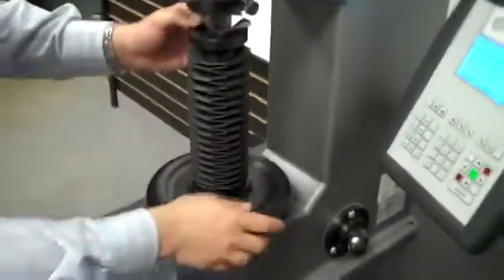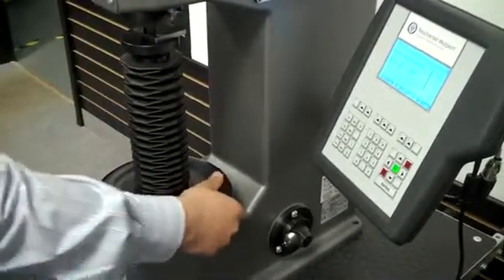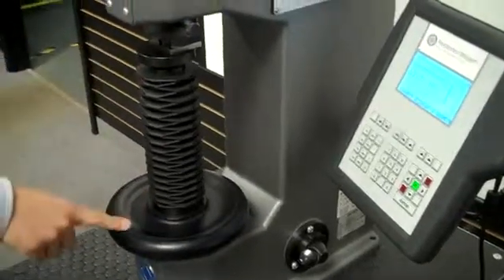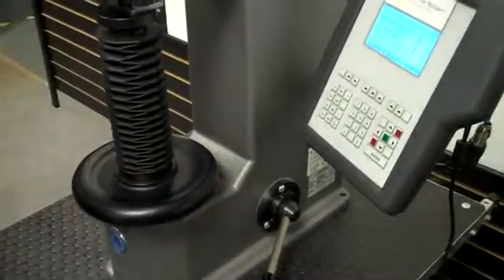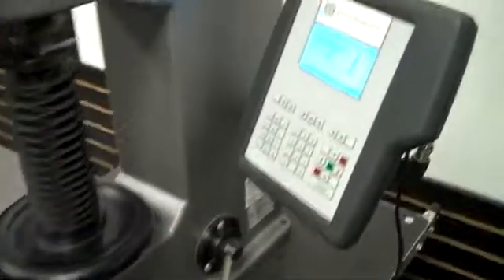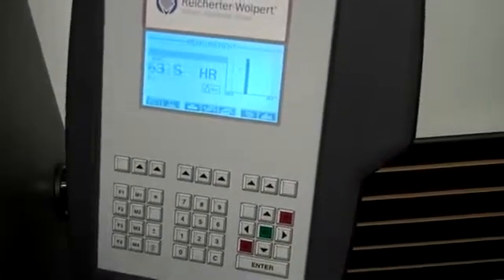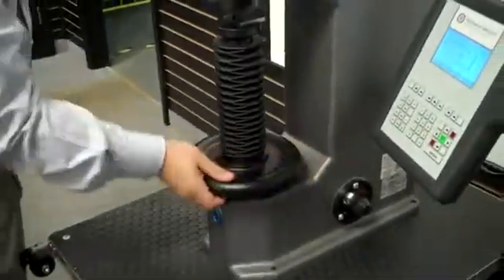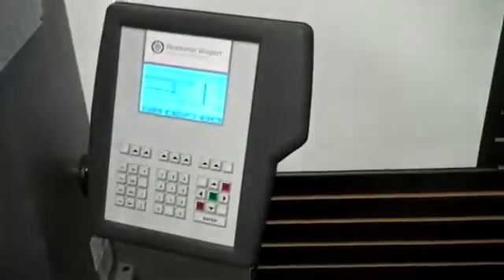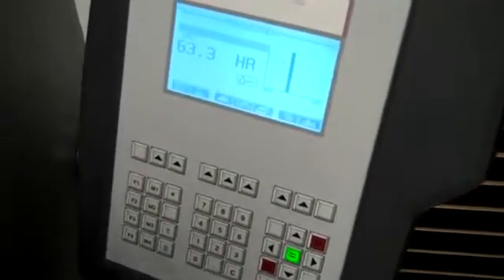Now I'll show you how we take a test on a block with the clamping on it. We raise the elevating screw, give it an extra quarter turn for tightness, and put the handle down. The machine counts down per ASTM, beeps when it's done, and gives you the result. It's very quick to go from test to test — and there's the beep, we can see our result.